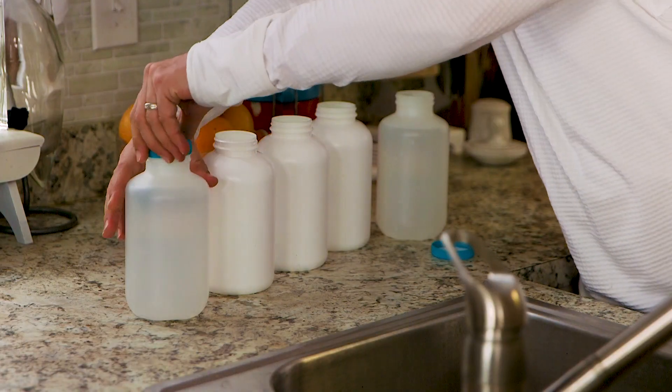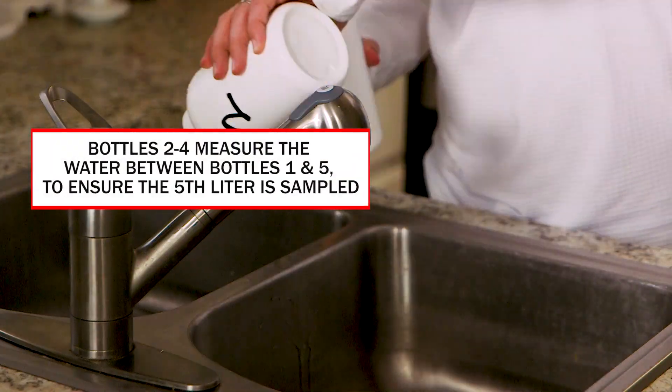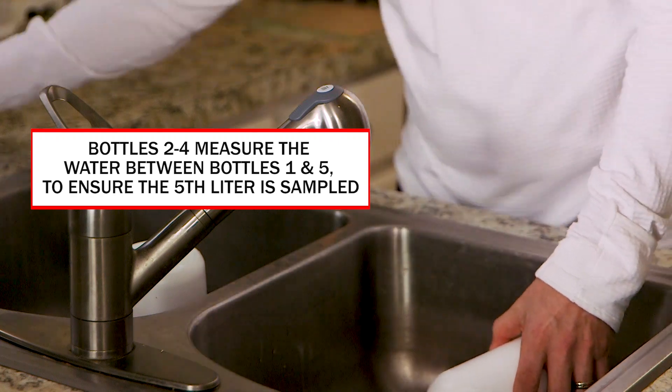Now tightly twist the caps back onto bottles one and five. Then pour the water out of bottles two, three, and four and allow them to dry.